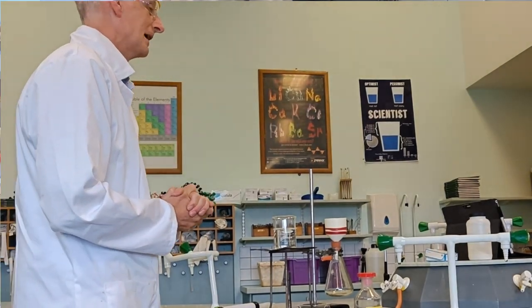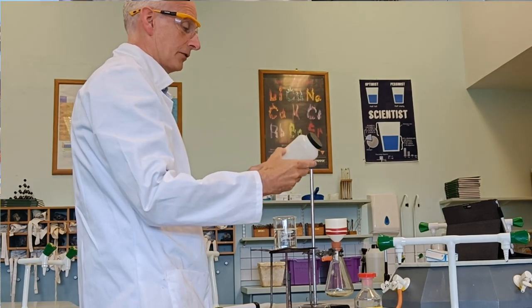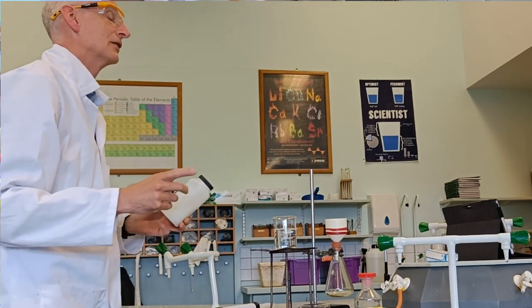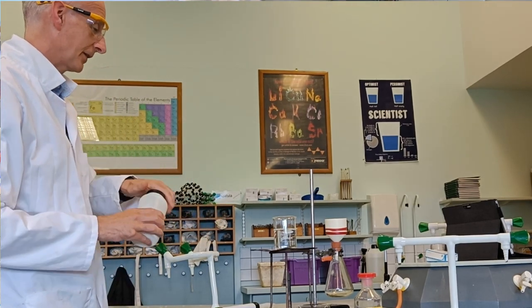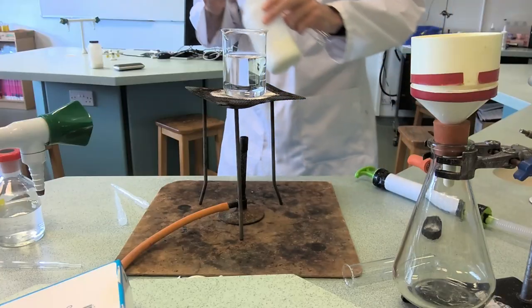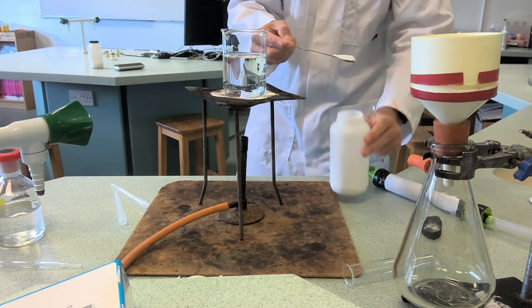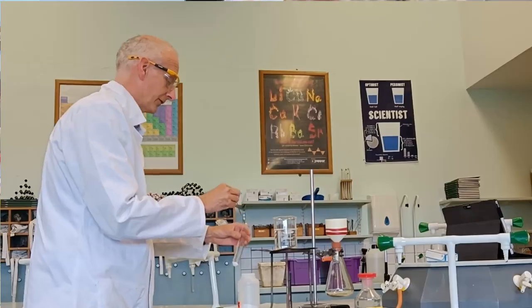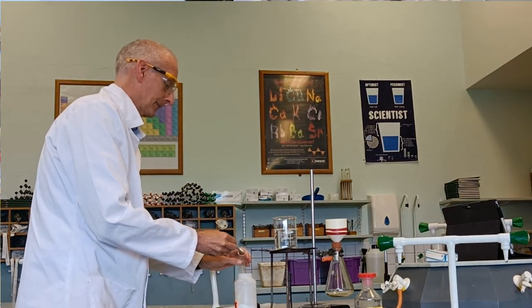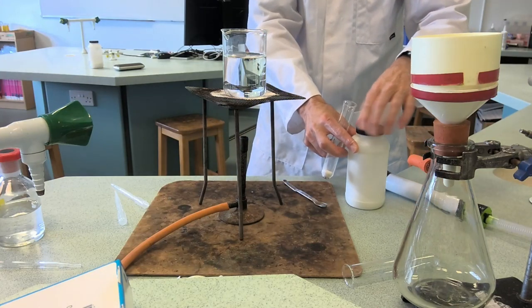Right, so what we've got is some impure benzoic acid with some soluble and insoluble impurities. We're going to take some of this and put it in a boiling tube and into a water bath. I'm going to use two spatulas because the purification process is going to lose us some material.